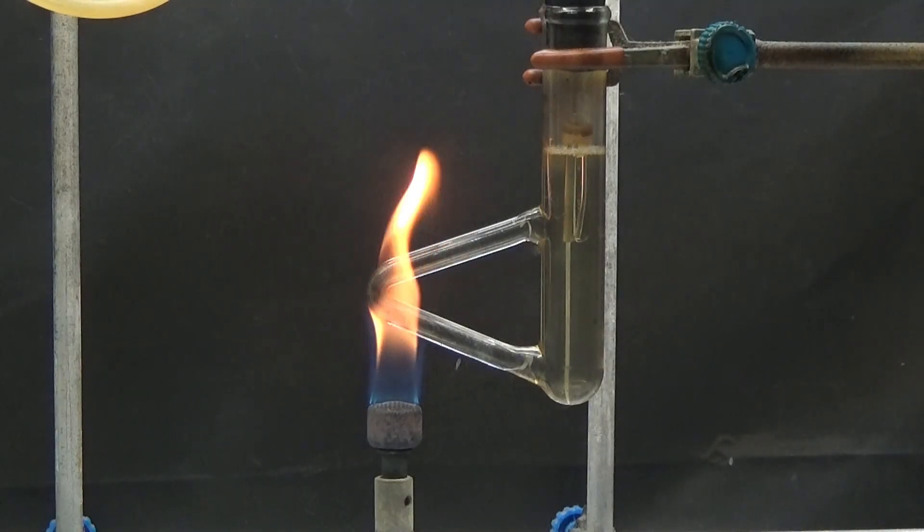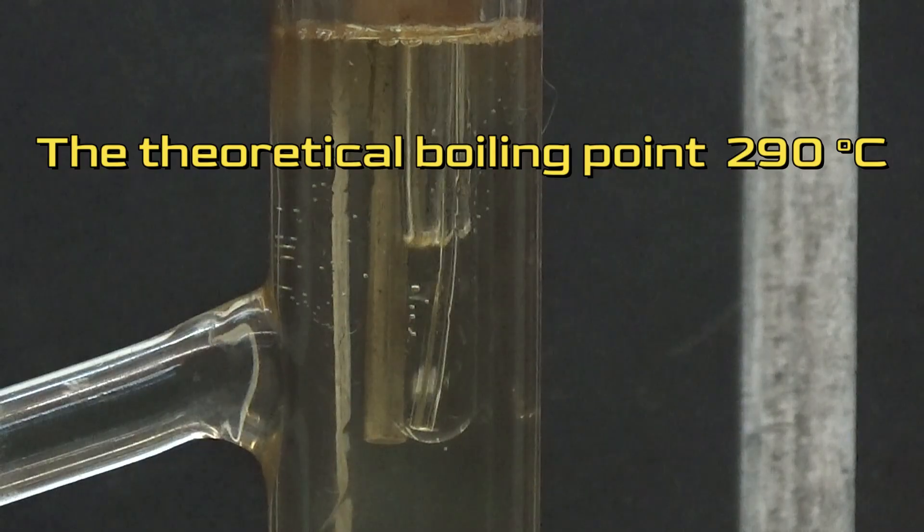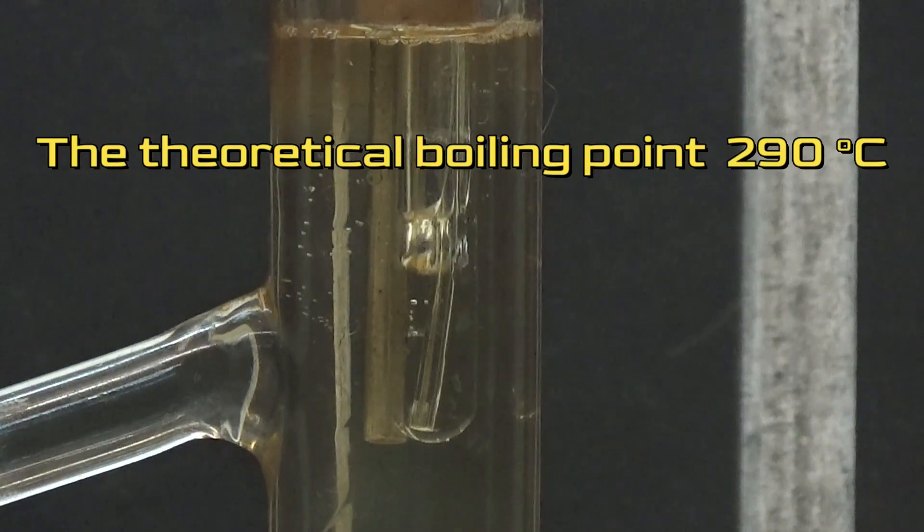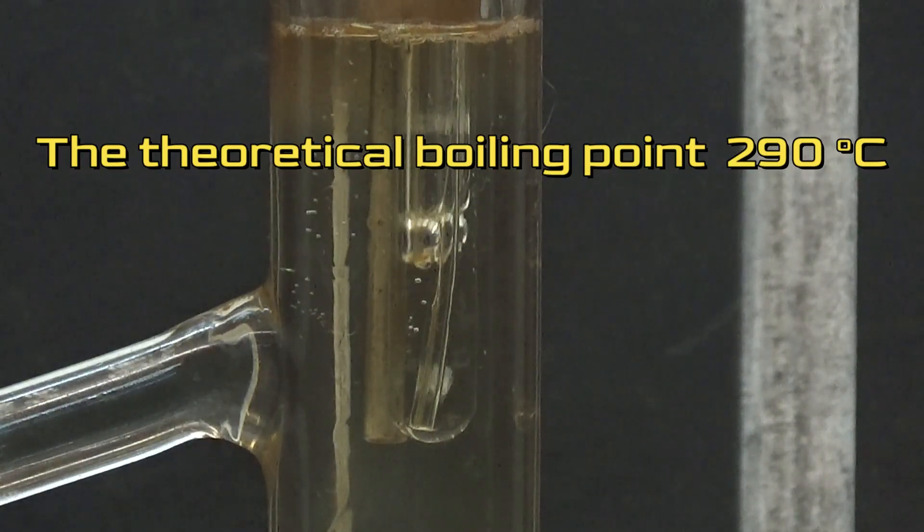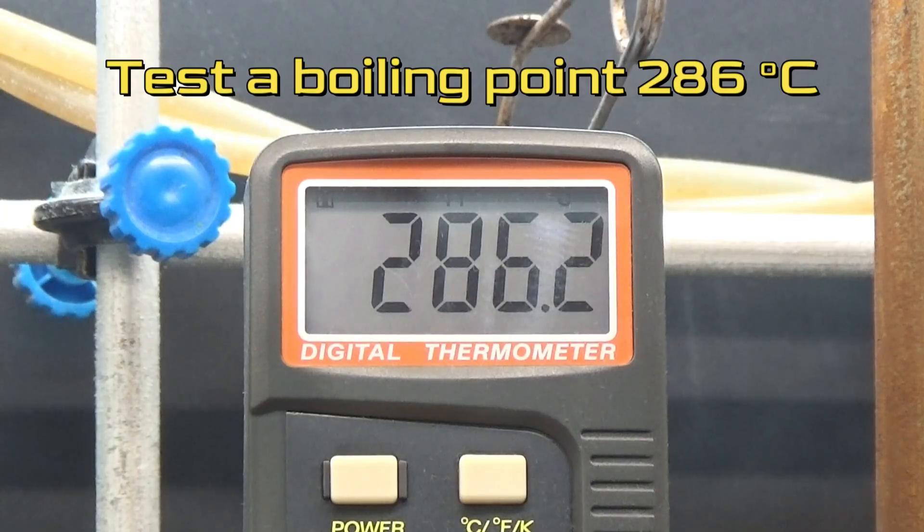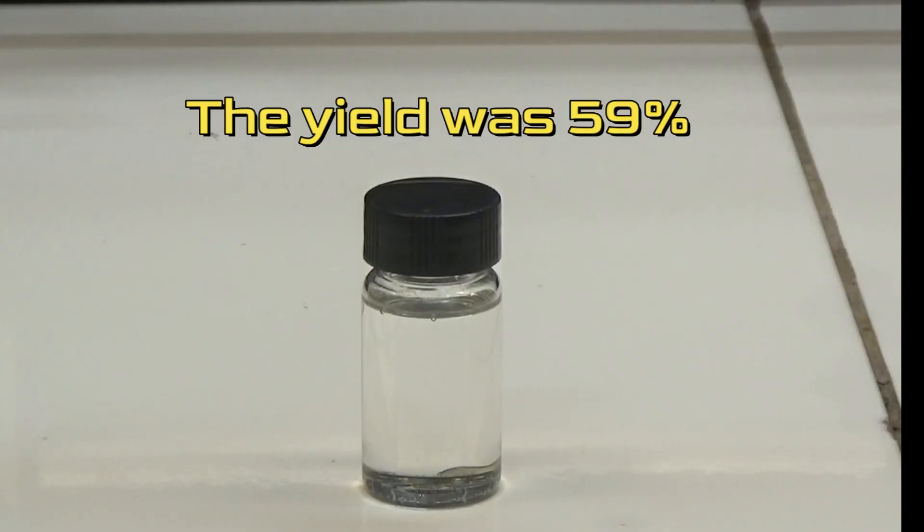The boiling point of the product obtained has been determined. The theoretical boiling point of diethyl phthalate is 290 degrees. In my test, a boiling point of 286 degrees was obtained. The yield was 59% with the phthalic anhydride reference.